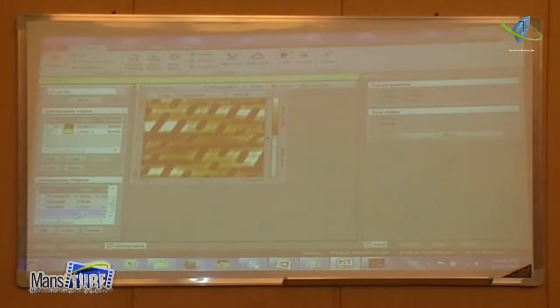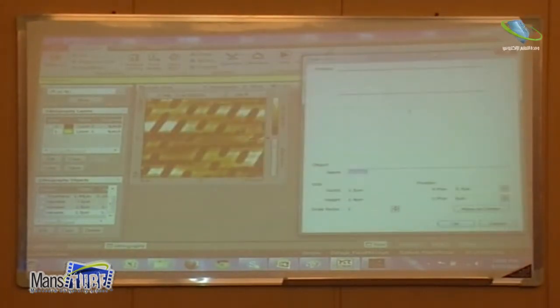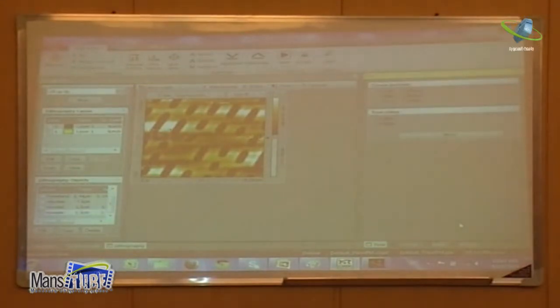Because it's relative to it. I mean, what I want to do is move this and put it here. Yeah. It will be minus here, 3.4 micron. Let's try it like this, it will go back to the middle. Okay, let me see. No, it's 3. So 0 is.